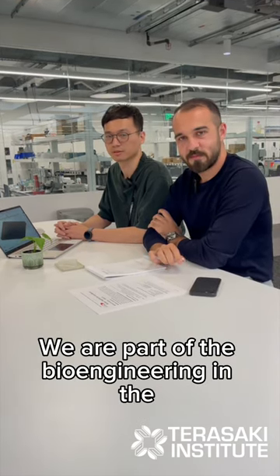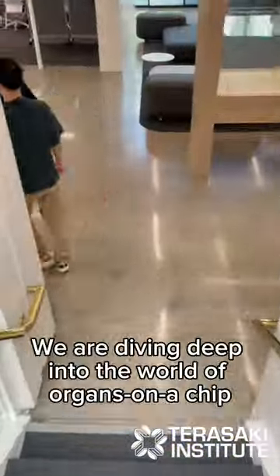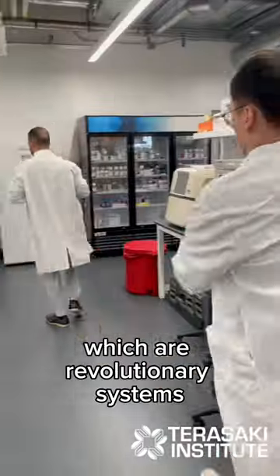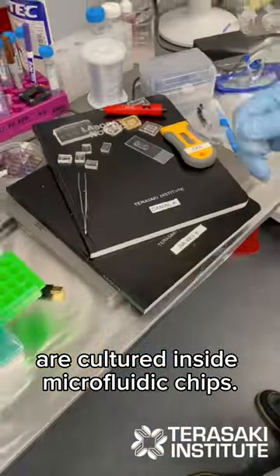We are part of the pioneering Organ-on-Chip team at Terasaki Institute. So let us show you what an organ-on-chip is. We are delving deep into the world of organs-on-chips, which are revolutionary systems where miniature tissues, whether engineered or naturally sourced, are cultured inside microfluidic chips.